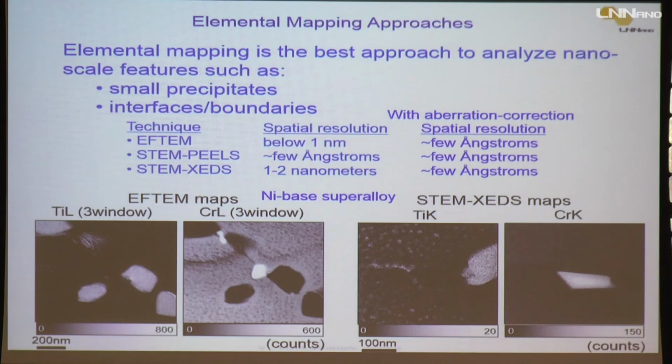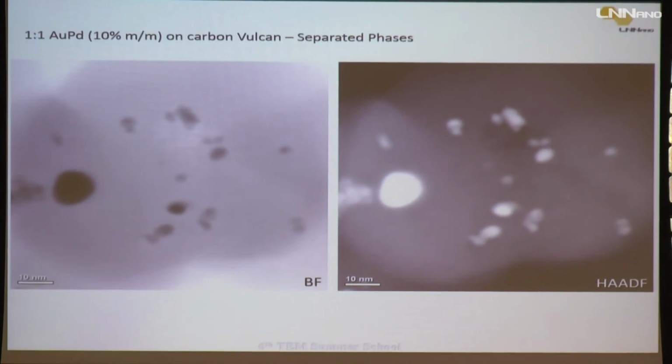Here there are some easy examples, okay, of comparison of EELS and EDX. You can see here from the scale bars that the information is about the same quality. With the aberration-corrected microscope, you have all kinds of spectroscopy you can get with an incredibly good resolution, okay?